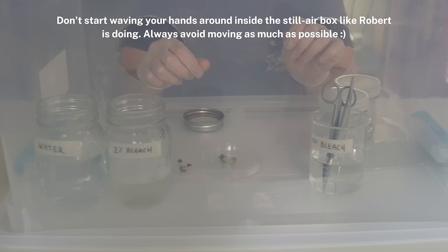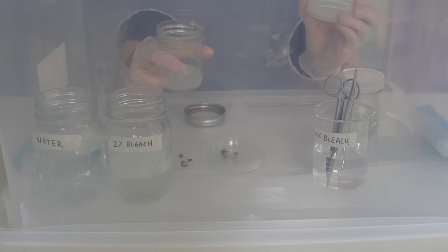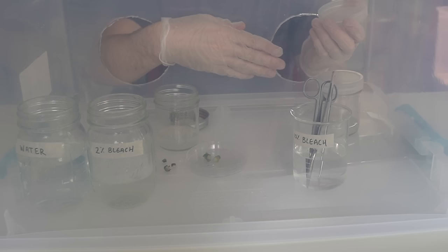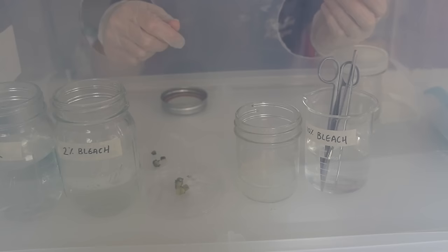Pick up one of the jars of media. Open it up and ideally hold the lid while you work, or place the lid face-up somewhere you won't reach over it. Use the forceps to pick up the tissue and push it into the tissue culture media slightly — one explant per jar.